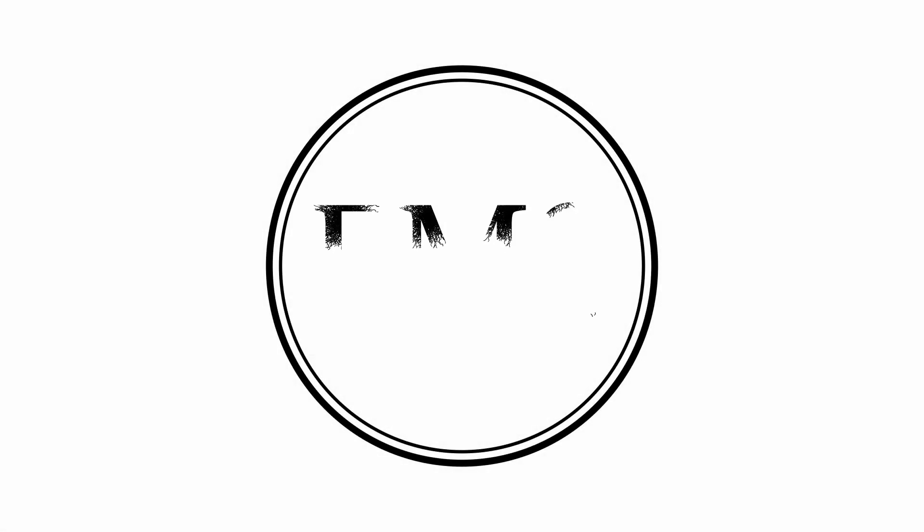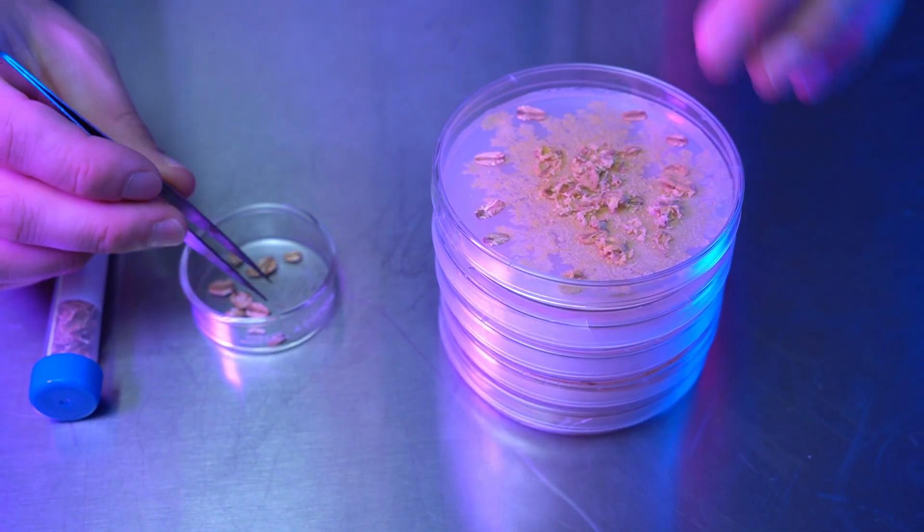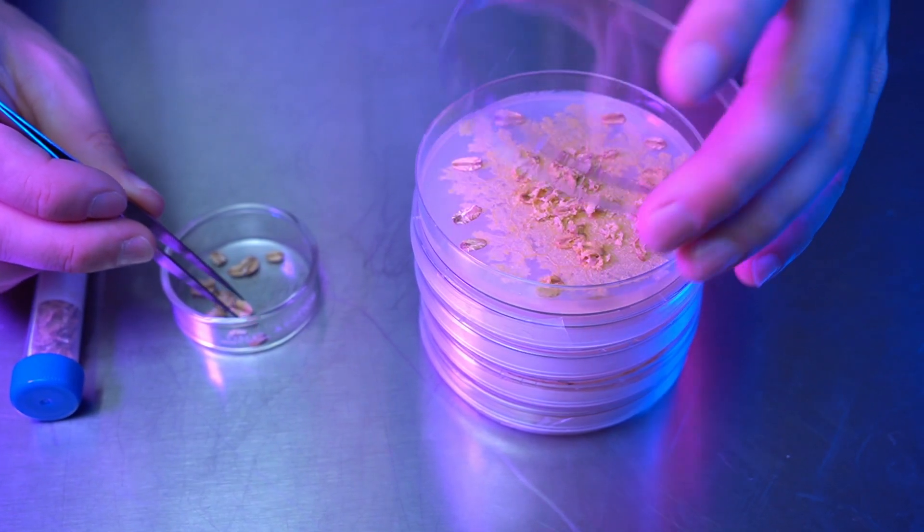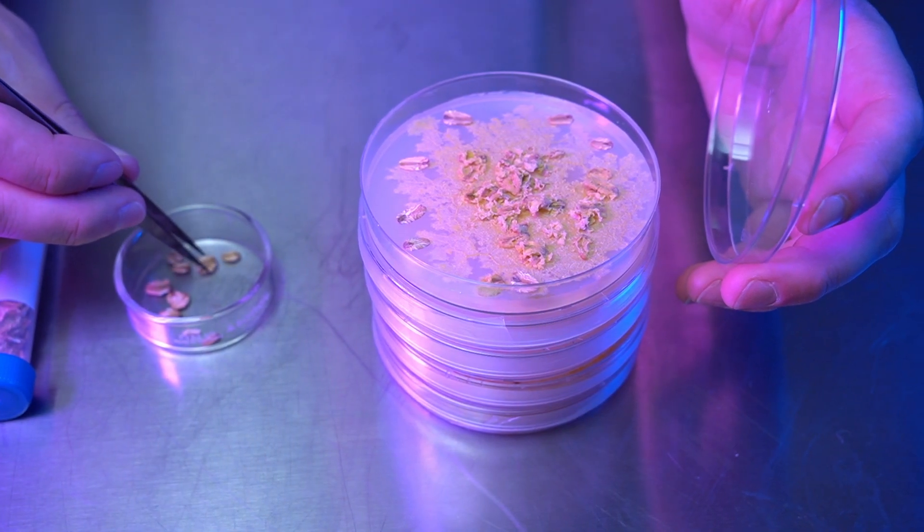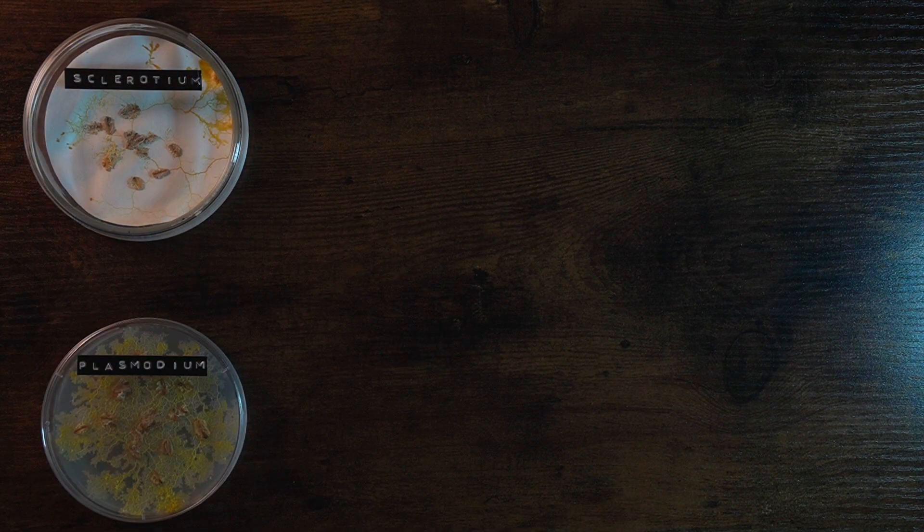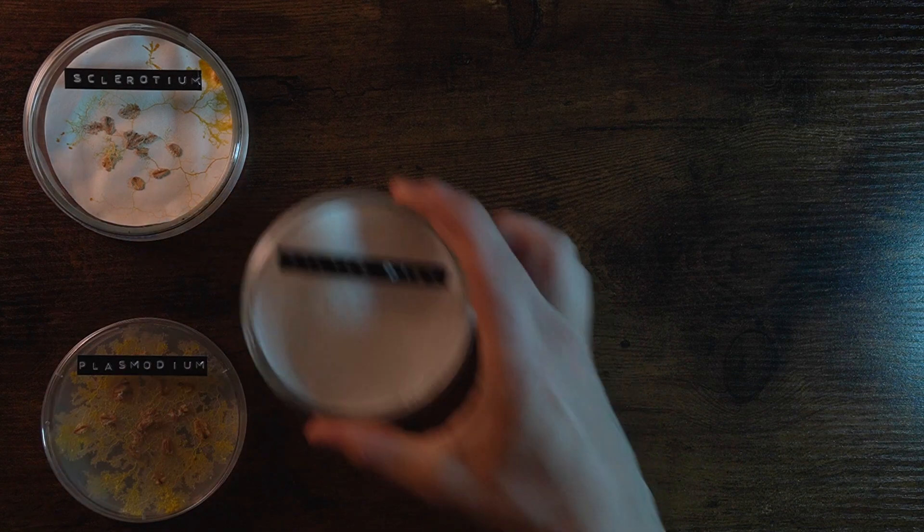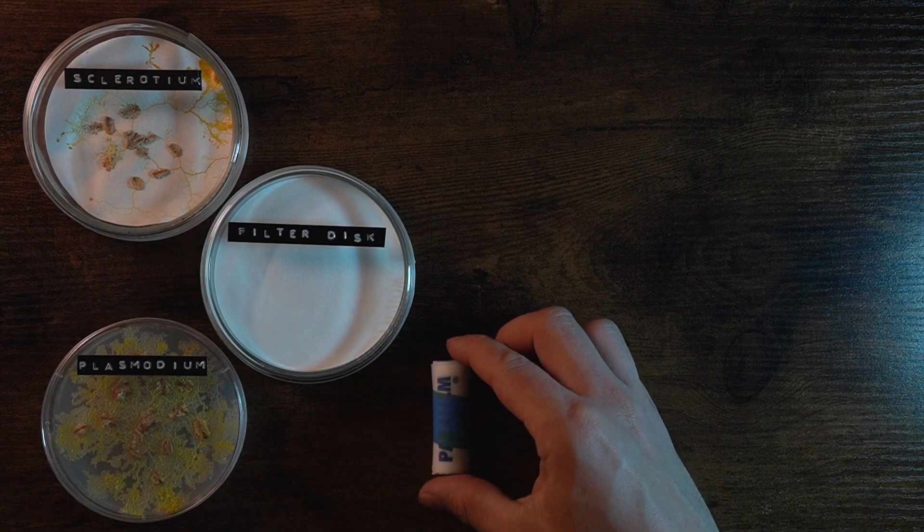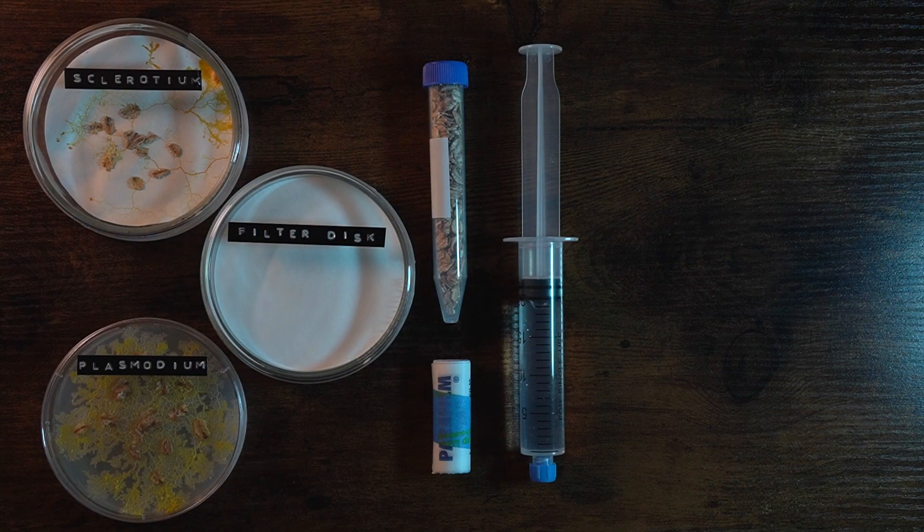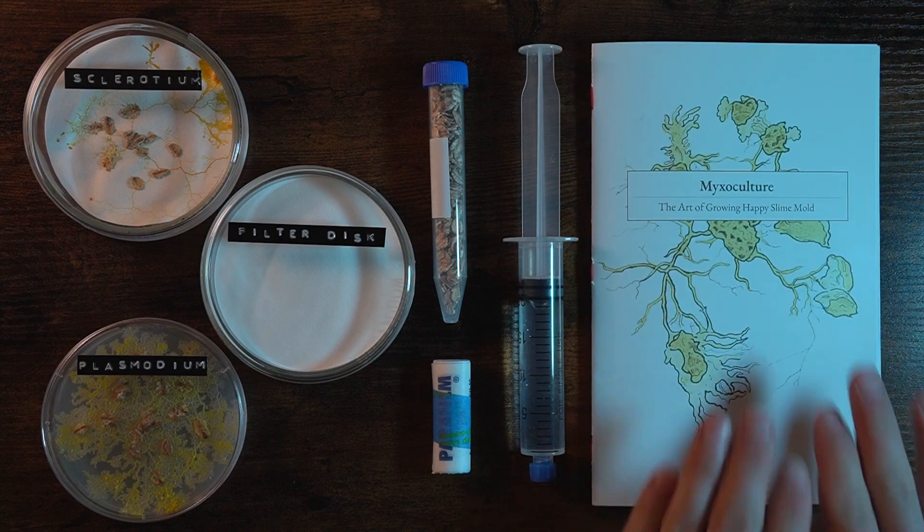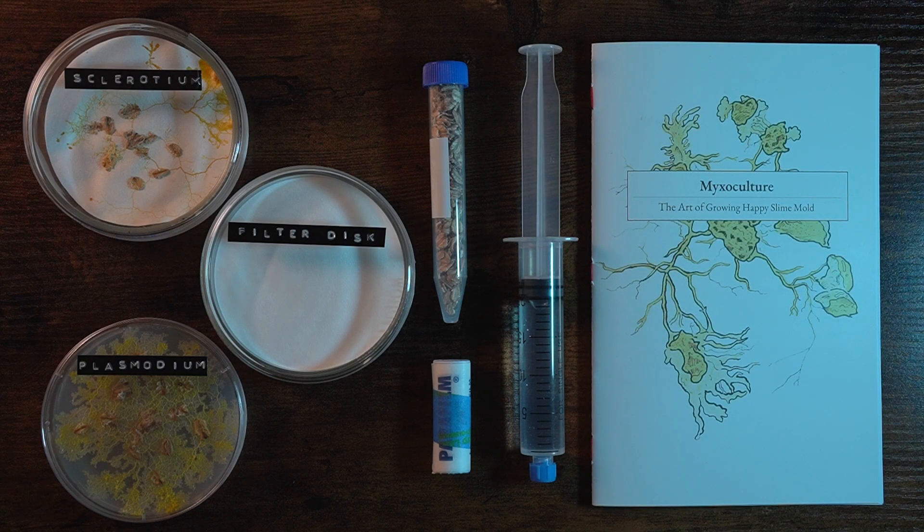Brought to you by the Fresno Mycology Society. If you would rather not try and source your own wild slime mold plasmodium, I sell culture kits with everything you need to get started. The kit contains a live plasmodium of Physarum polycephalum, a dehydrated sclerotium of the same species, a petri dish with filter papers, a roll of parafilm, a tube of sterilized oats, and a syringe of sterile water, as well as an illustrated manual that describes all we will be discussing in this video, and much more.